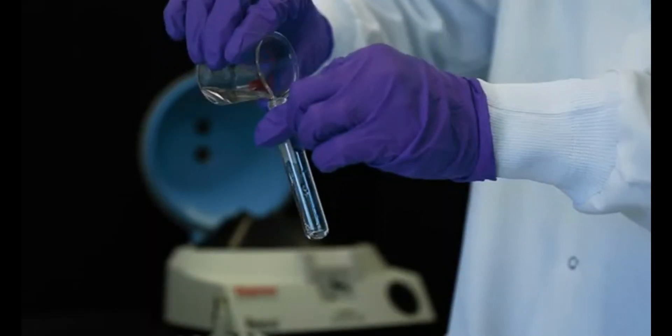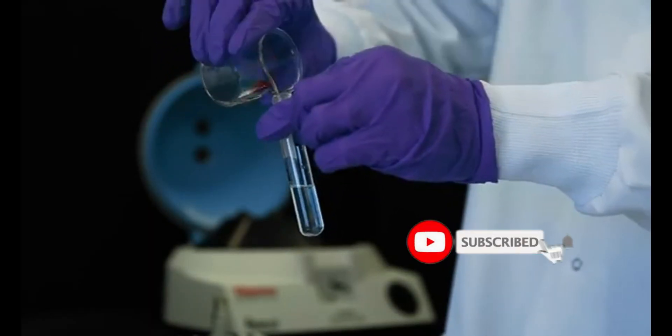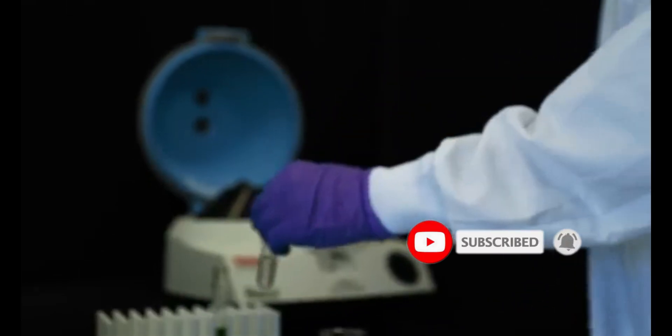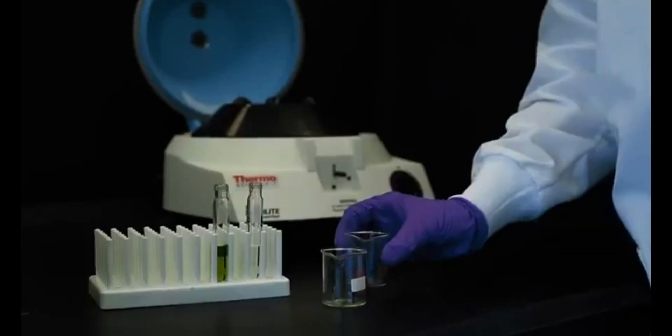You need an even number of test tubes. If you do not have an even number of samples, fill a test tube with water to the same height as the sample.